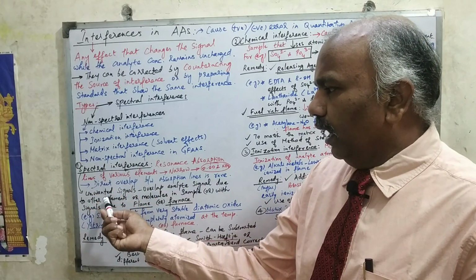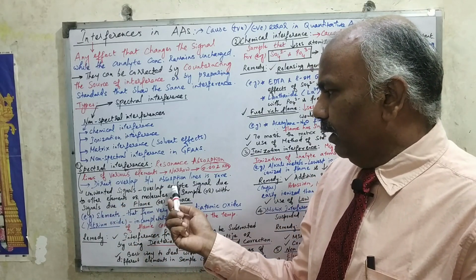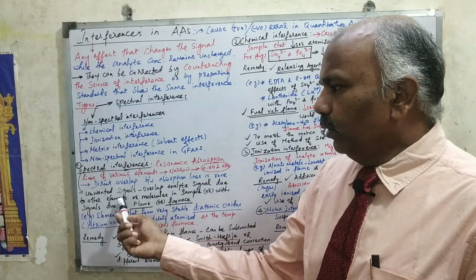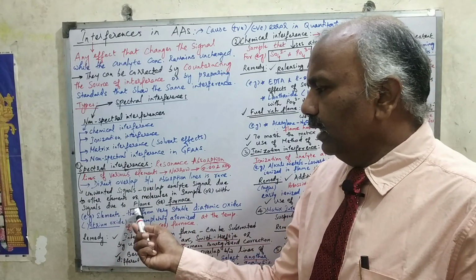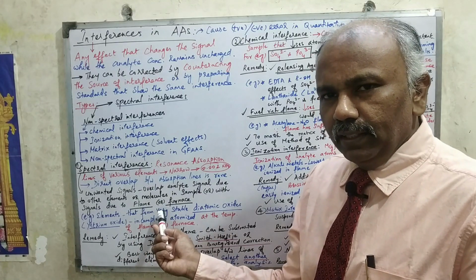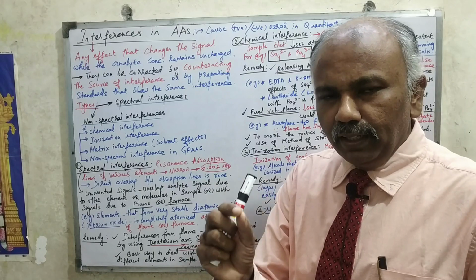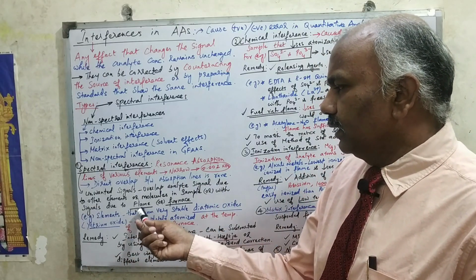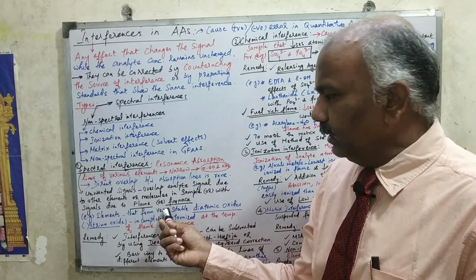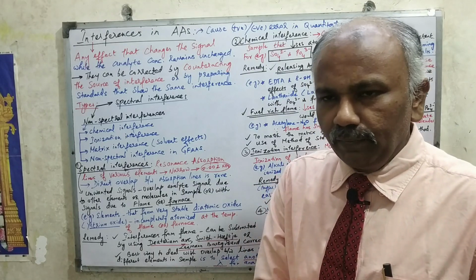Spectral interference produces unwanted signals, an overlap of the analyte signal due to other elements or molecules in the sample, or with signals due to the flame or furnace. Either due to some interfering elements, which is very rare, or mainly due to signals from the sample in the flame or furnace, you may get some minor spectral interference.